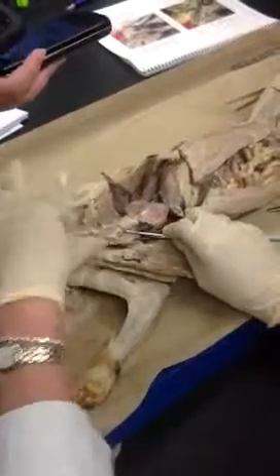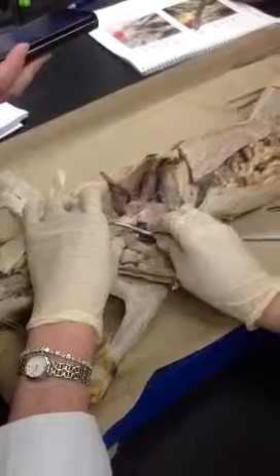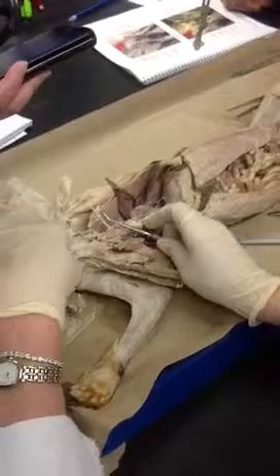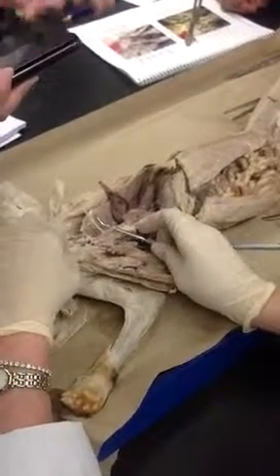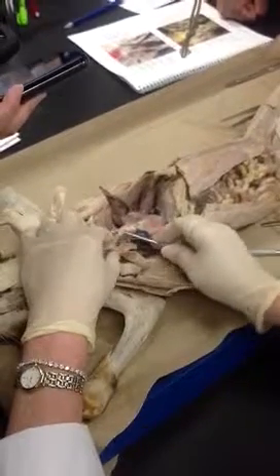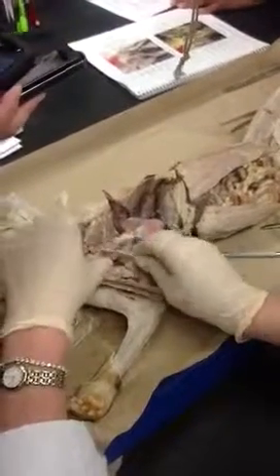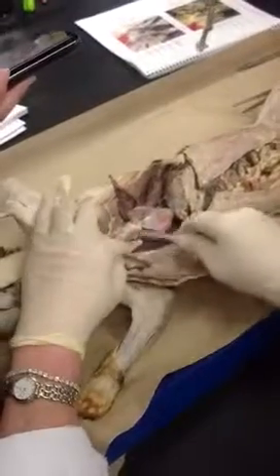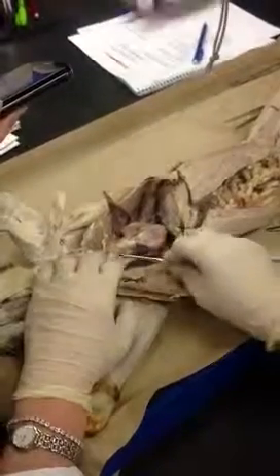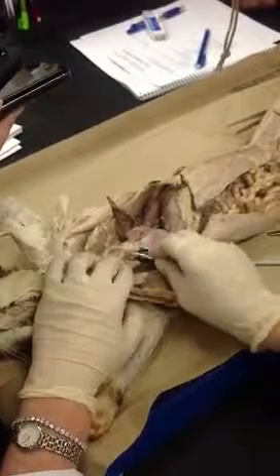So you have your 2 carotid arteries up here, the cat's left and the cat's right. This one is the left subclavian, which branches off to the left. Totally lost my train of thought, carotid artery. That one's over here. This is the brachiocephalic. This one on the right for the cat then branches off into your right common carotid and your right subclavian right here. So you've got these 2. Okay, branches right here. You get one right here. Brachiocephalic, there's the left subclavian.